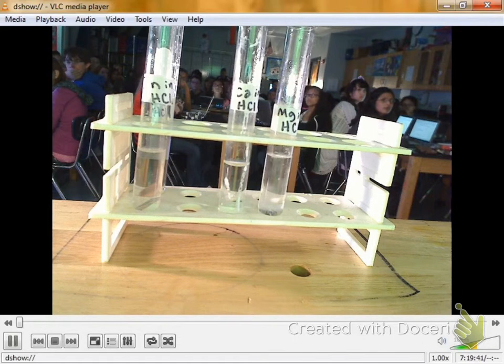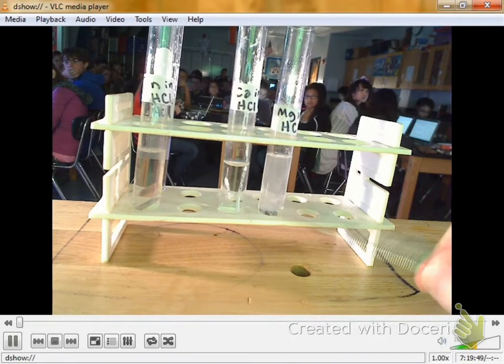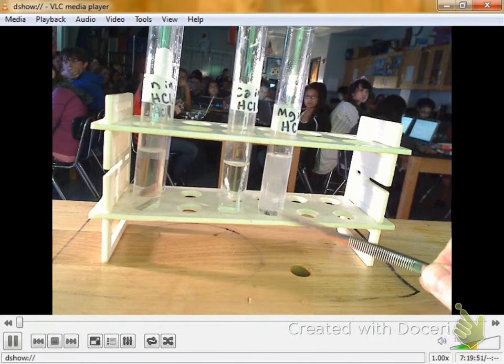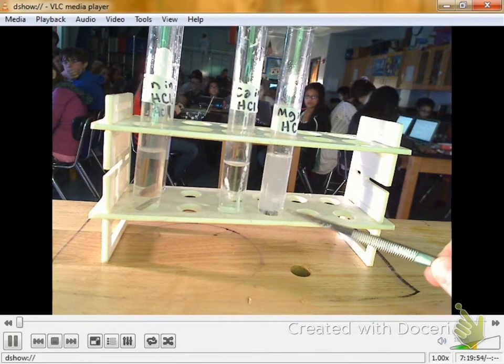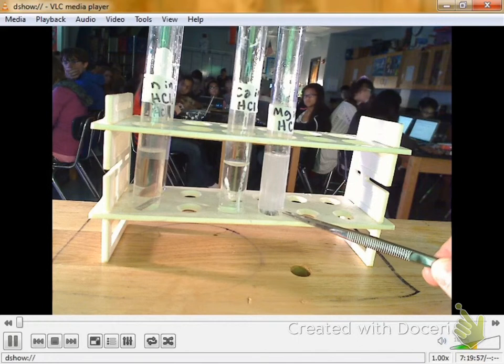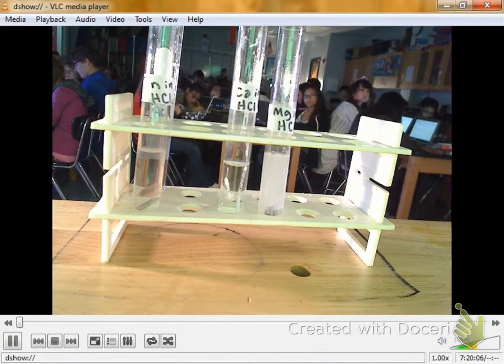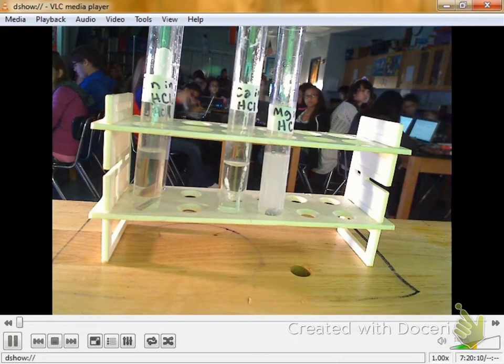And what happens if I put magnesium in? It makes gas. It's slowly starting to react with the hydrochloric acid. We start to see a lot more bubbles now. And it's kind of hard to see on the screen here. But even down here in the test tube, it's still kind of hard to see. Oh, by the way, don't forget goggles. Everybody should have their goggles on.